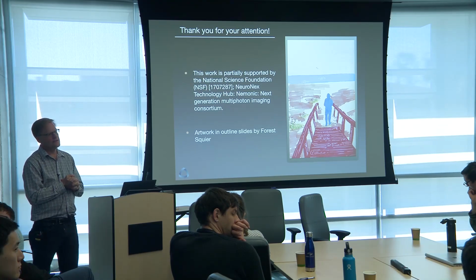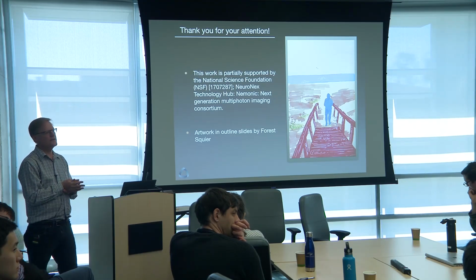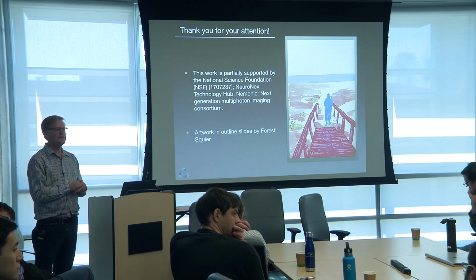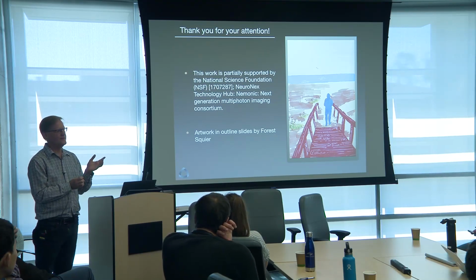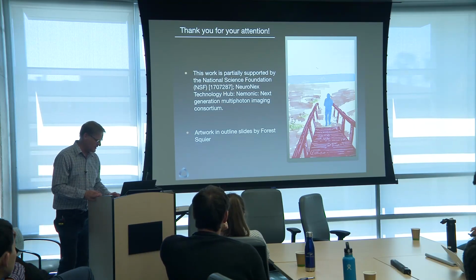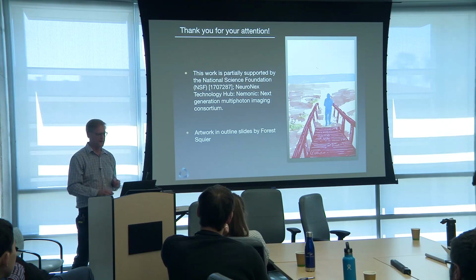Do it completely 2D field, and then modulate the carrier frequency of the pixels. Yeah, you can do that, and the reason that we don't do it though is we found out, if you're interested in doing multi-photon imaging at all, the power of the laser you need is too high.